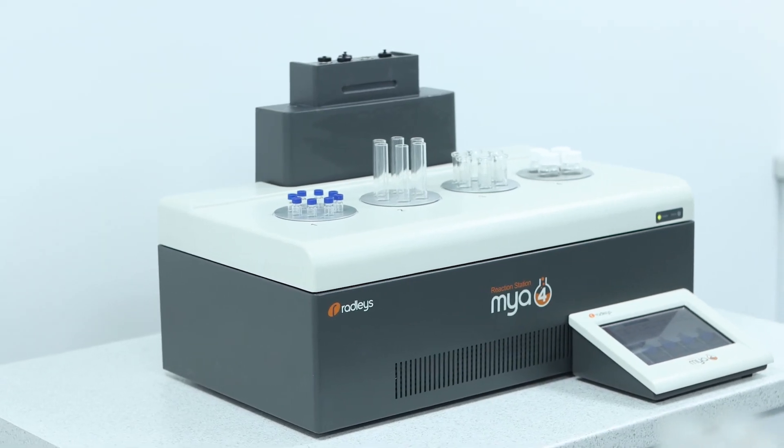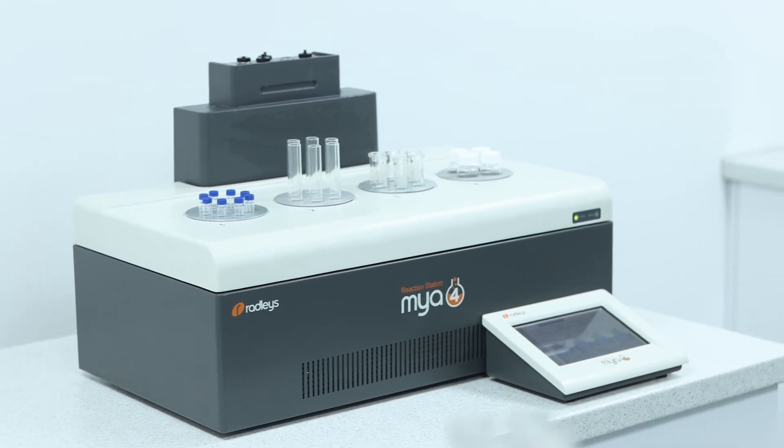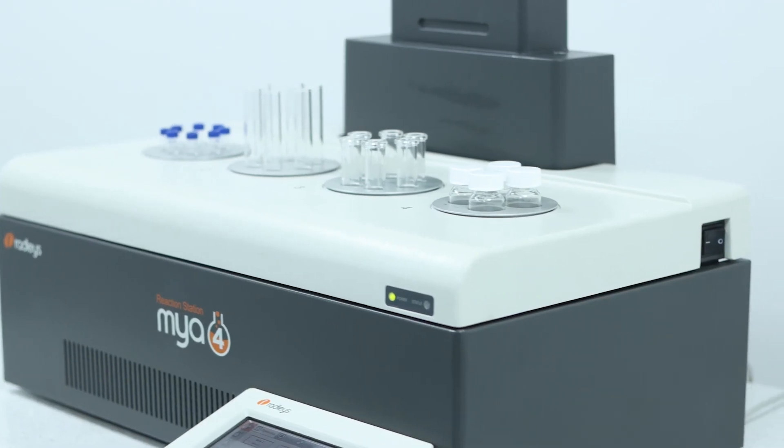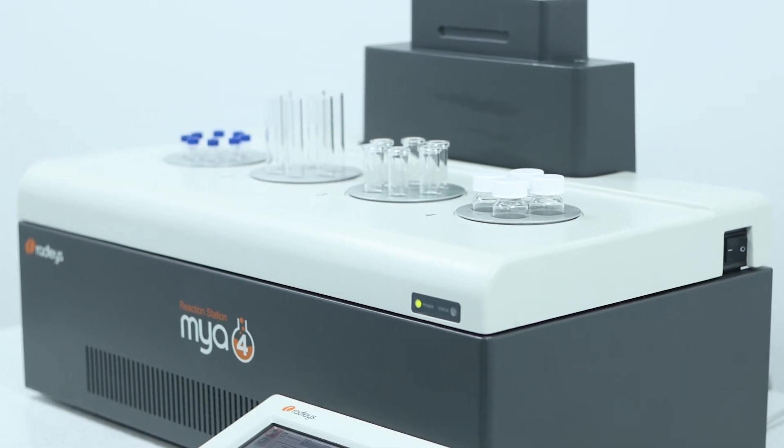Heating and cooling several tubes and vials is easy with the Maya IV reaction station, especially as it accommodates a variety of commonly used options.